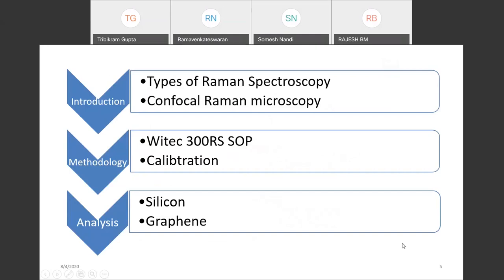In the present talk, I am discussing types of Raman spectroscopy, particularly confocal microscopy. We have a WITec 300RS Raman spectrometer, and I am discussing the standard operating procedure, calibration with a silicon sample, and how to analyze silicon and graphene samples. With this WITec RS spectrometer, it is also attached with AFM — atomic force microscope — and SNOM — near field scanning optical microscope.